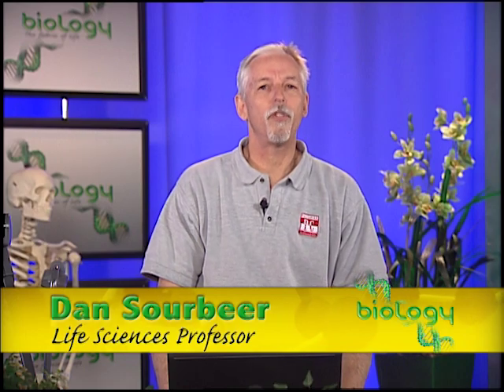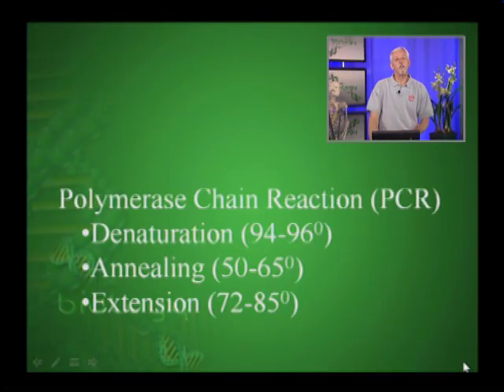Okay, today I'd like to continue our discussion of DNA technology and talk about some different examples of technology and how they're utilized. So the first one I want to discuss is something called polymerase chain reaction, or PCR. The purpose of PCR is to make copies of a gene. It's a pretty simple process in that it involves a cycle of heating followed by cooling, and these alternate over and over again to produce our copies of genes.